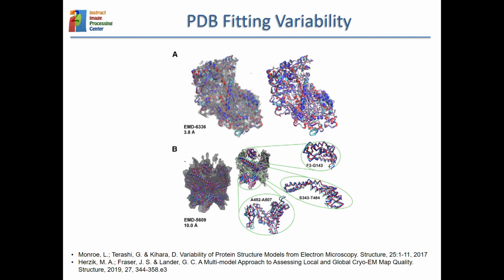There is also an interesting idea: when you make an atomic model of a cryo-EM map, there might be regions for which you are very sure that the atomic model goes in that way, but there are some other regions, especially because you have lower resolution there, for which you have more possibilities to fit your atomic model.